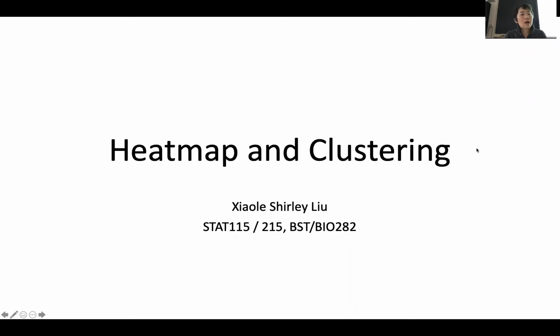All right. So in your differential expression analysis, after you get the RNA-seq data, you will have a FASTQ file. When you run Salmon or STAR followed by RSEM, you will get an expression index value, and that's estimated sample by sample. It's normalized together, but every sample will have a file and you put them in a directory. Then when you run DESeq, you specify these samples are my treatment and these samples are my control, and then it will give you the level of differential expression.